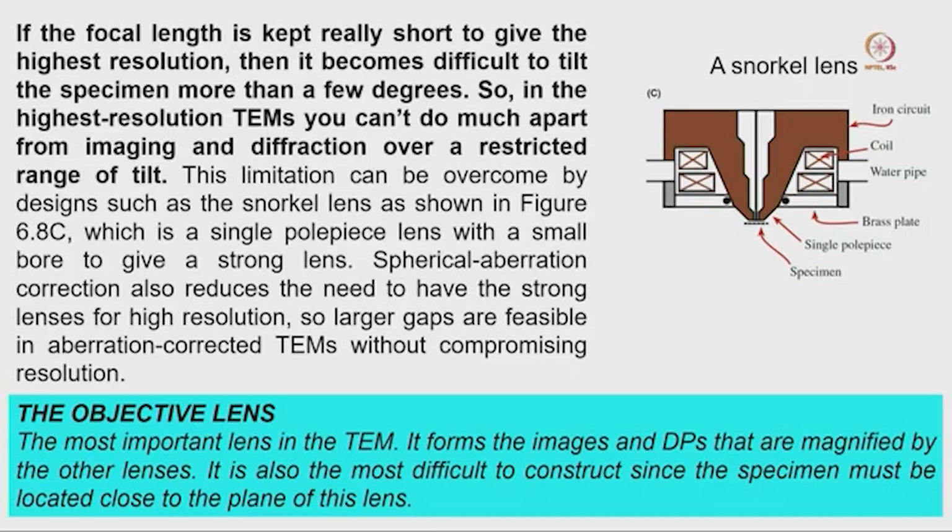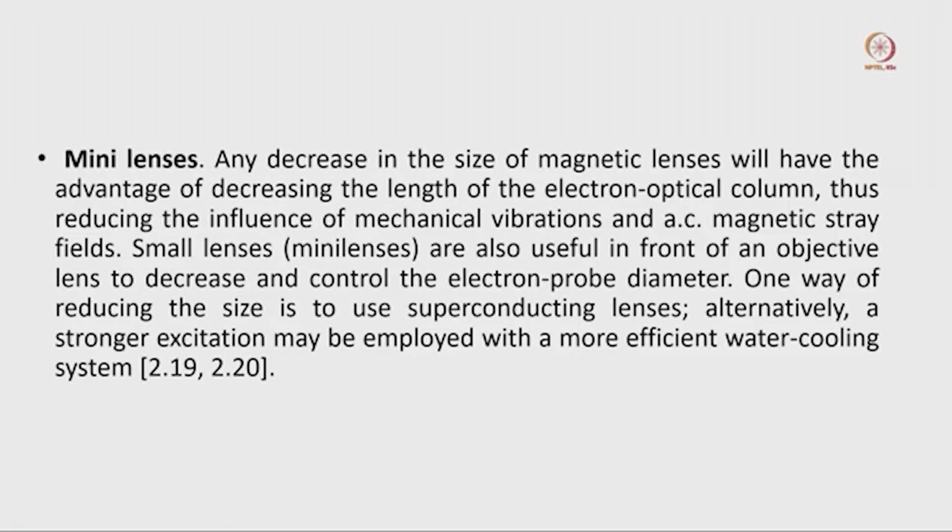Now, this is another lens system that is not required for our purposes. Our main aim is discussing the biological side. So you just remember that for the biological side, mostly we are using a lens system where the objective lens is split into two halves.